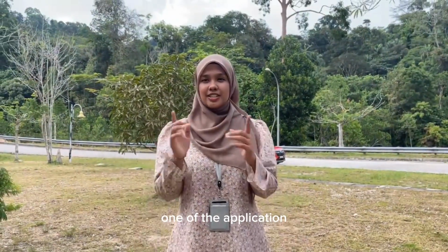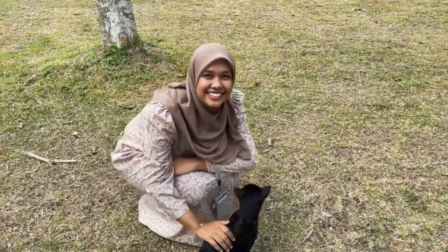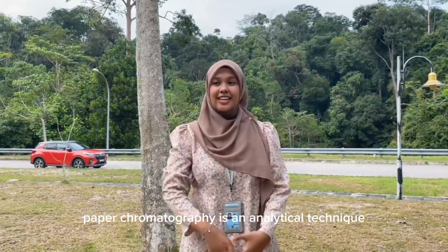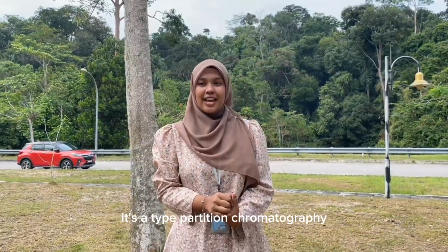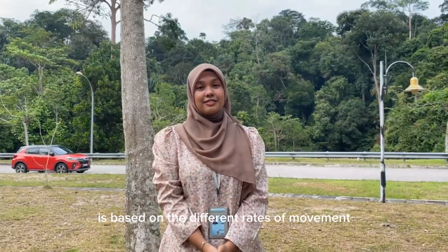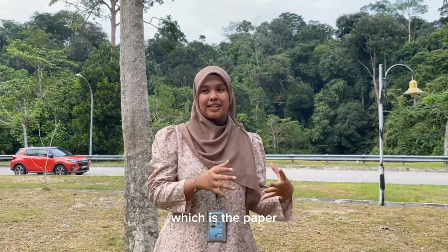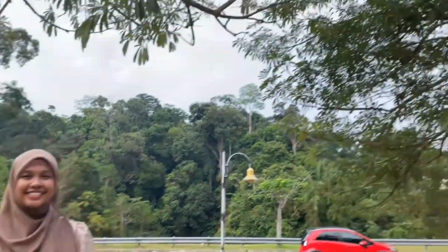One of the applications of chromatography is paper chromatography. Paper chromatography is an analytical technique used to separate and identify mixtures of substances. It's a type of partition chromatography where the separation of components is based on their different rates of movement through a stationary phase, which is the paper, while being carried by a mobile phase, which is the solvent.